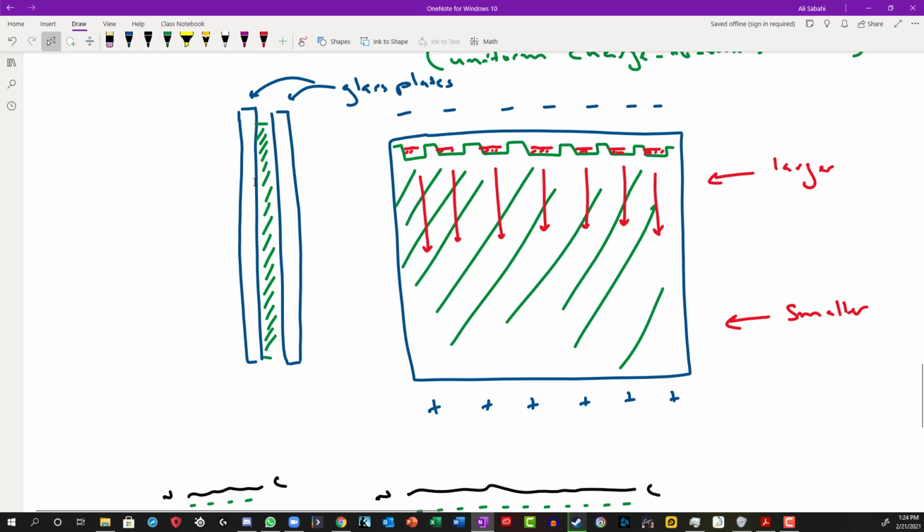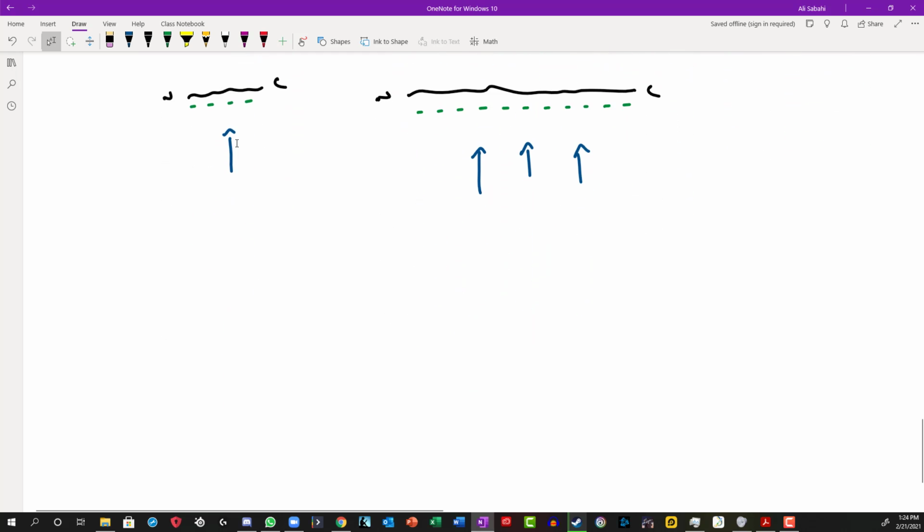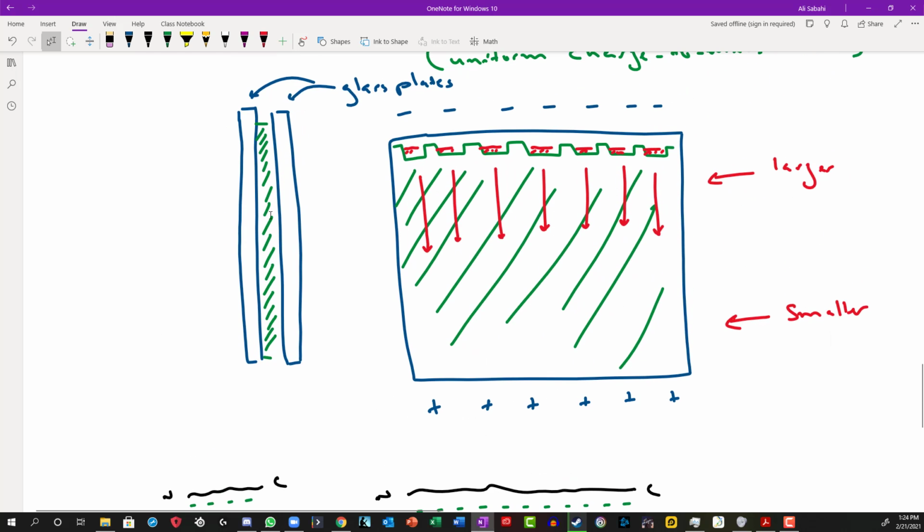And if we're talking about cellular proteins, meaning that we have disrupted our cells and all the cytoplasmic proteins are now spilled out, we treat it with SDS and we put it onto the wells of our polyacrylamide gel, and we apply the voltage and we let it run for a few minutes, we'll get a big smear of proteins. Because, just erasing these arrows, as the samples run through and they get separated based on size, there's a lot of proteins.